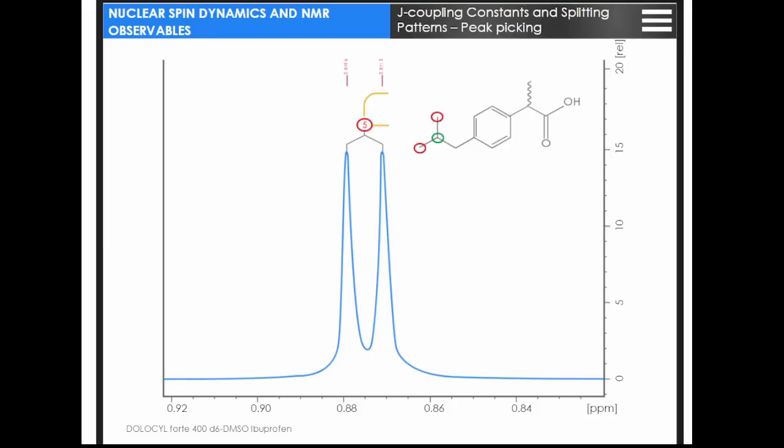Note that the protons from two adjacent methyl groups are not coupled to each other, since they are separated by 4 covalent bonds, resulting in J-coupling constants smaller than the resonance line width and thus not directly observed. Thus, the analysis of the multiplet pattern confirms the assignment made on the basis of the peak integration.